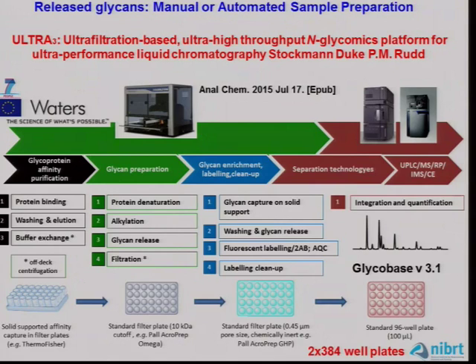You then need to prepare the glycans: protein denaturation, alkylation, glycan release, filtration, cleanup. Then you can capture it on a solid support, wash again, and release the glycans.